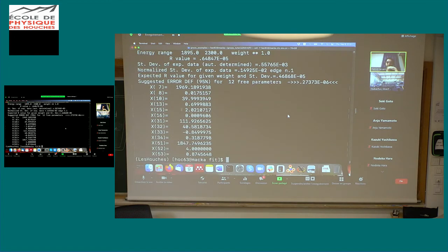So you see, the numbers are the same that we used in the table. So 15 was the distance, 2.021. Then this is the Debye-Waller, the angle, the sigma square of the angle, the correlation, and so on. The E0, S0, and so on. And if you see, the coordination number we kept fixed, so it remains at 4. So, okay.